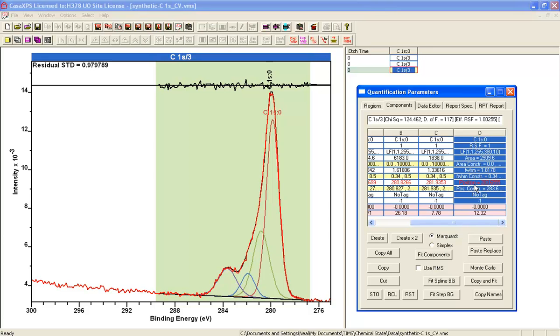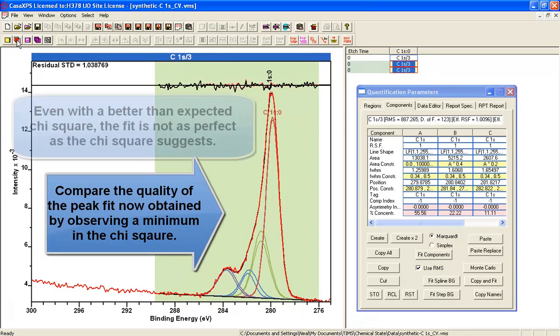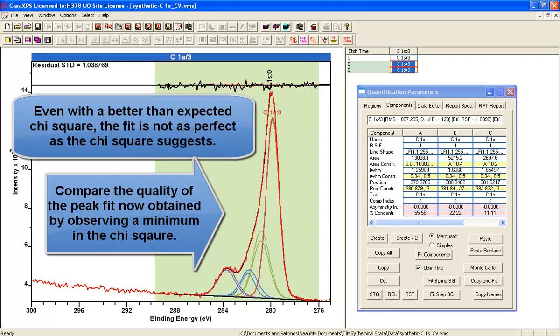So we can go about this and then again, we do the comparison. And again, no, we did not get the original peak model back.